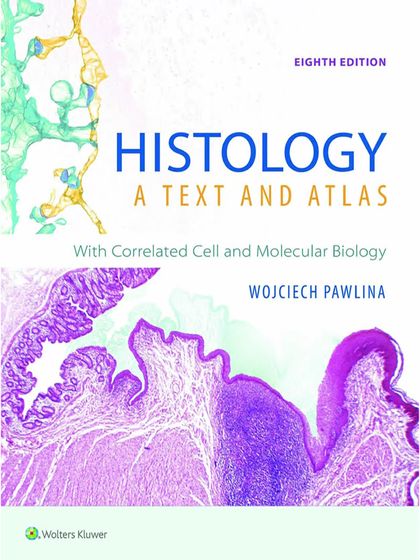Now for the cutting. We use a specialized machine called a microtome. It's essentially a high-precision slicer. It cuts these wax blocks into incredibly thin sections. We're talking maybe 5 to 15 micrometers thick. Micrometers, how thin is that, really? Well, think about a human hair. It's like slicing that hair lengthwise into dozens of even thinner ribbons. It's that thin. Wow. These really delicate slices are then floated onto water. Floated? Yep, helps flatten them out. Then they're carefully picked up and mounted onto glass slides using an adhesive.